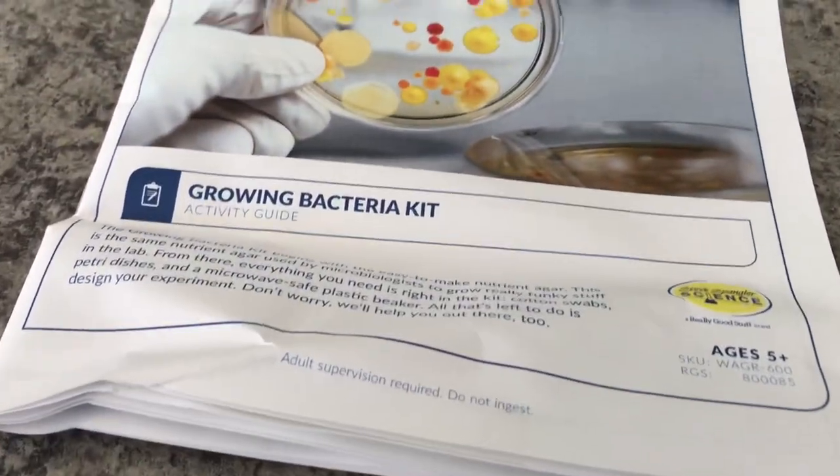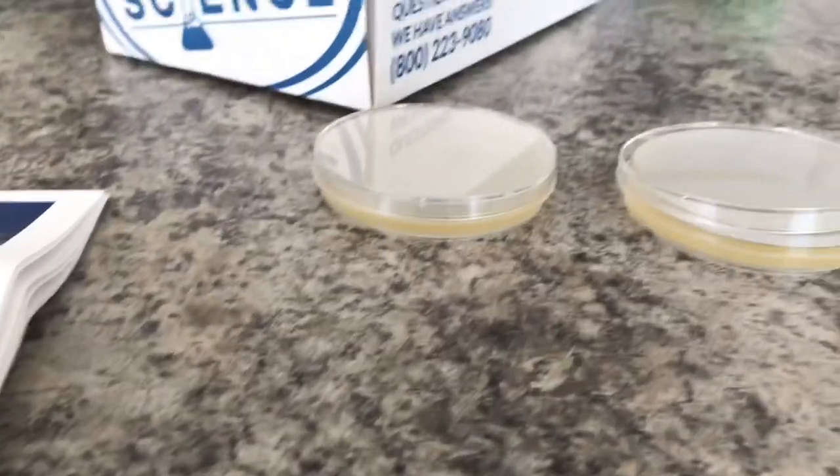Here we have Steve Spangler's Science Growing Bacteria Kit. Justin has been wanting to do this, so I got it and I'm making the petri dishes. Right now these are cooling down and then we're gonna get to it.